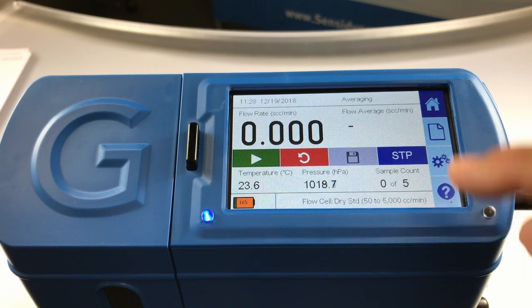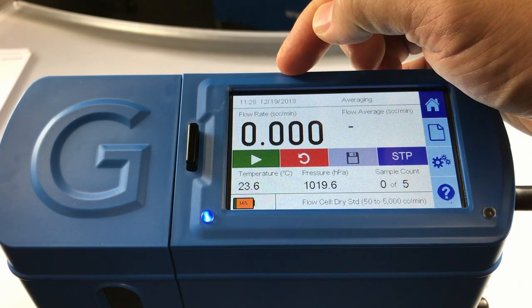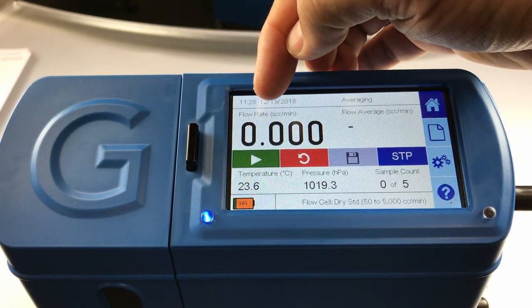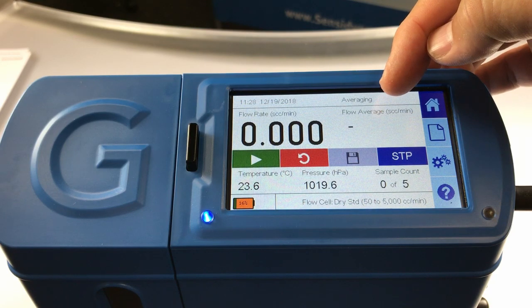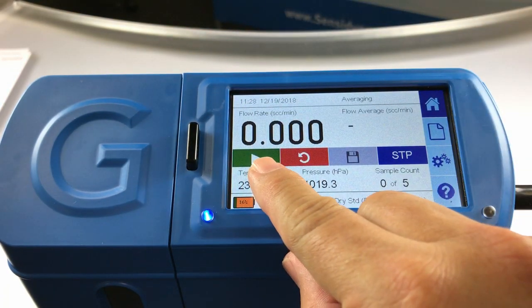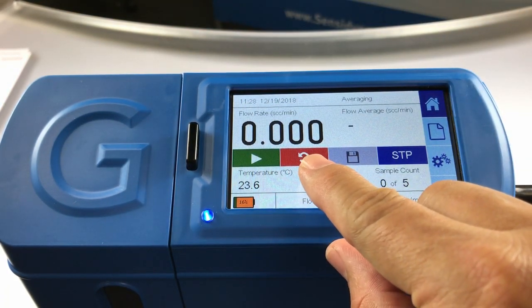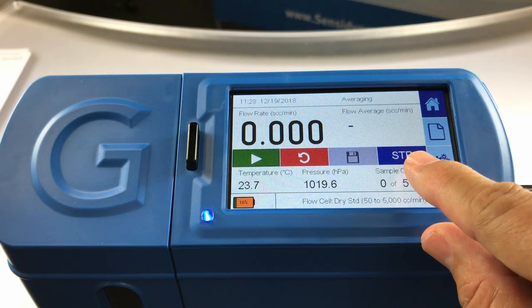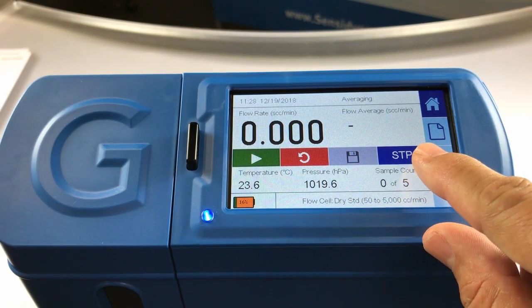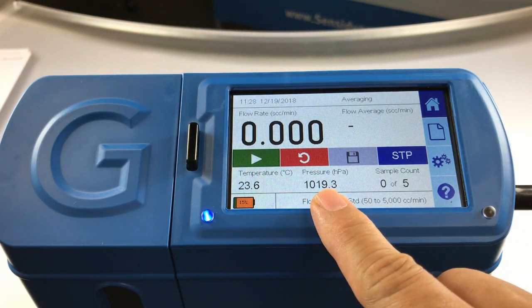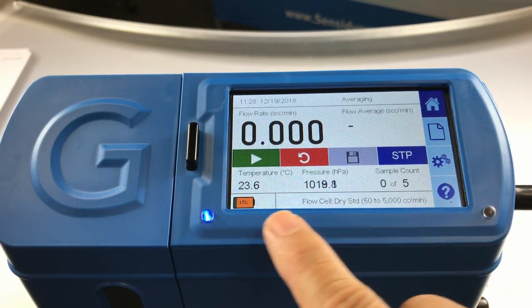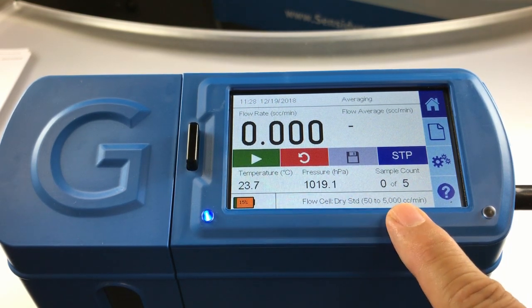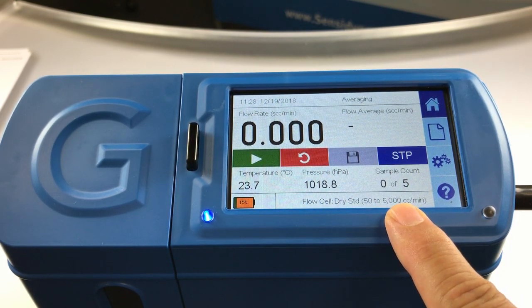The home screen displays the time and date across the top, the sampling mode, the live flow rate, the average flow rate, the play and stop button, the reset button, the record save button, the STP or volumetric flow button, the ambient temperature, the ambient pressure, the sample count, the battery life, and the type of flow cell along with the flow cell's flow range.